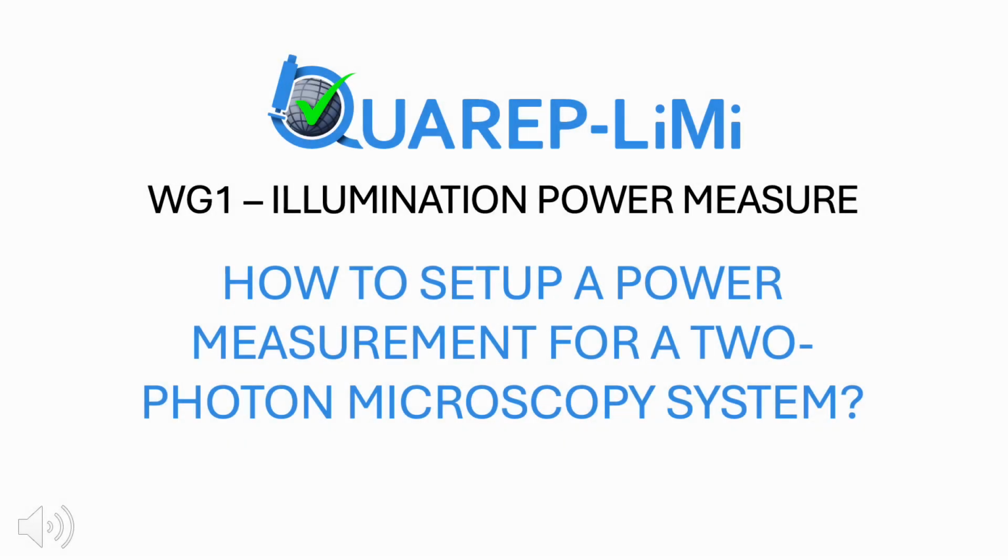Welcome to this tutorial on setting up a power measurement for a two-photon microscope system. This video is brought to you by the Quality Assessment and Reproducibility for Instruments and Images in Light Microscopy Working Group 1.